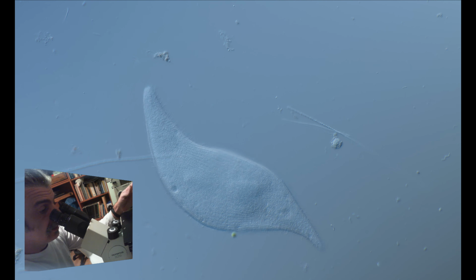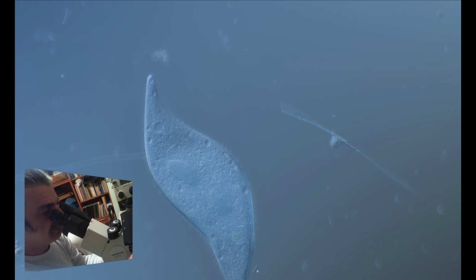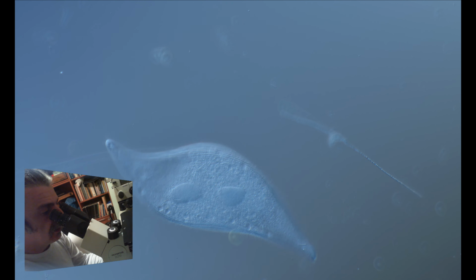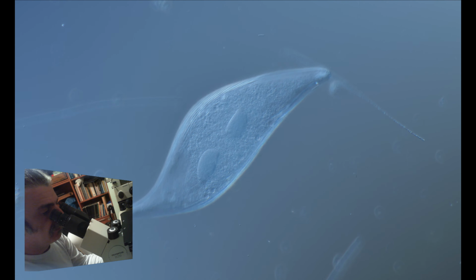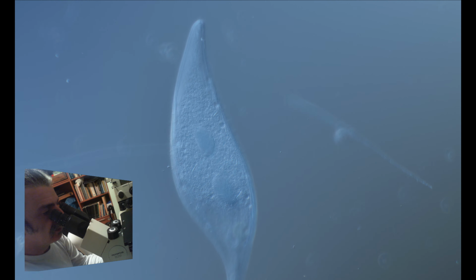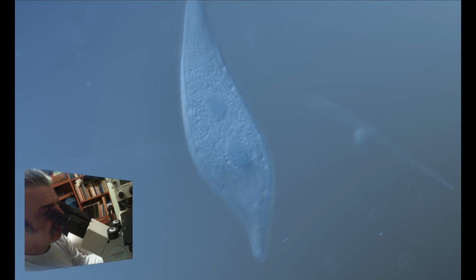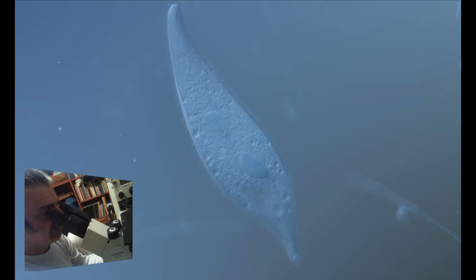And I need just a second to adjust the color ring on my objective to fight spherical aberration. And here is Lionotus, and you can spot in its middle two large macronuclei, and there's a smaller one inside.